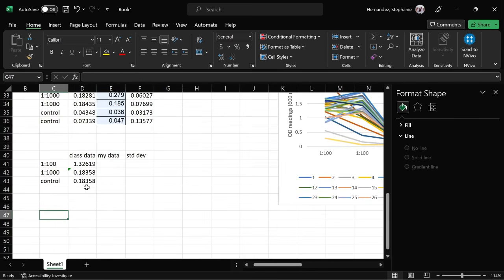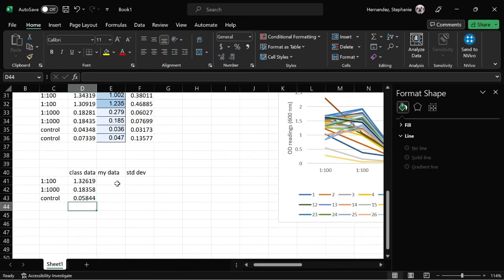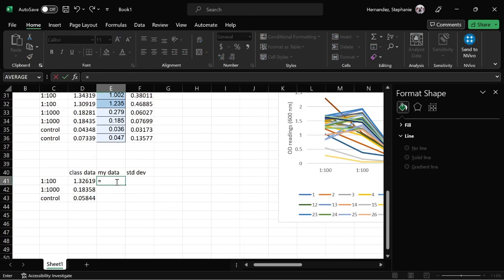Here's a good example as to why I always check. If you click it, you can see it didn't pick up on the pattern. And if I had just not checked, I would have gotten wrong results. A good way to fix it, it still saves you time, is you just literally drag it and make it where you want it to be. So honestly, we can just do that from the first one.